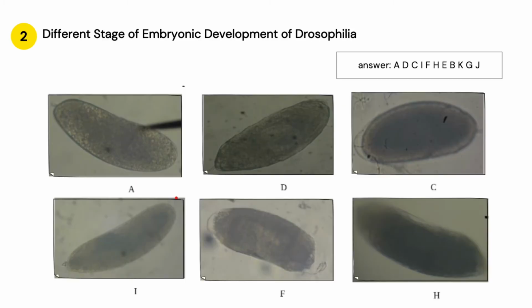Stages in embryonic development of Drosophila start with early cleavage, where the nuclei cleave in the central region. Next is the migration of cleavage nuclei, where nuclei migrate to the periphery. Then, formation of the syncytial blastoderm follows, where pole cells form posteriorly. Next is the formation of the cellular blastoderm, where cell membranes form between the nuclei. And then early gastrulation occurs, where the ventral furrow forms, as well as the thickening of the posterior plate below the pole cells. Next is the midgut invagination, where the midgut invagination can be seen ventrally, as can the cephalic furrow.